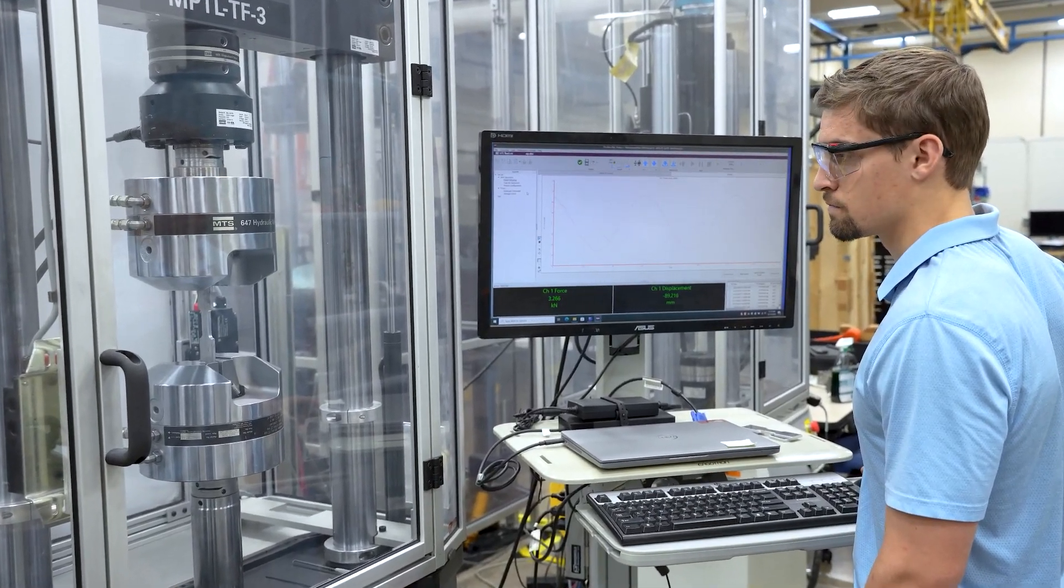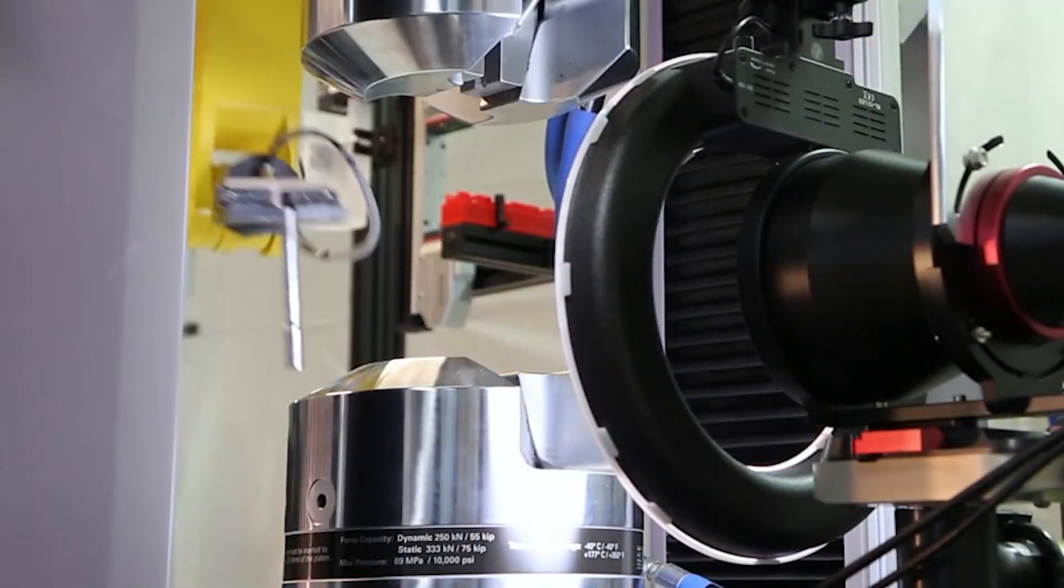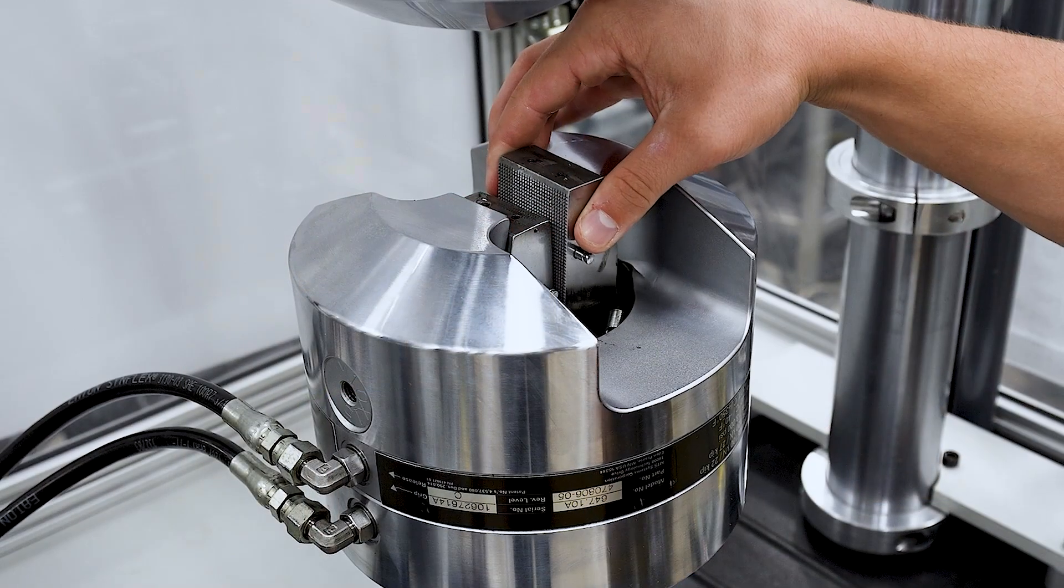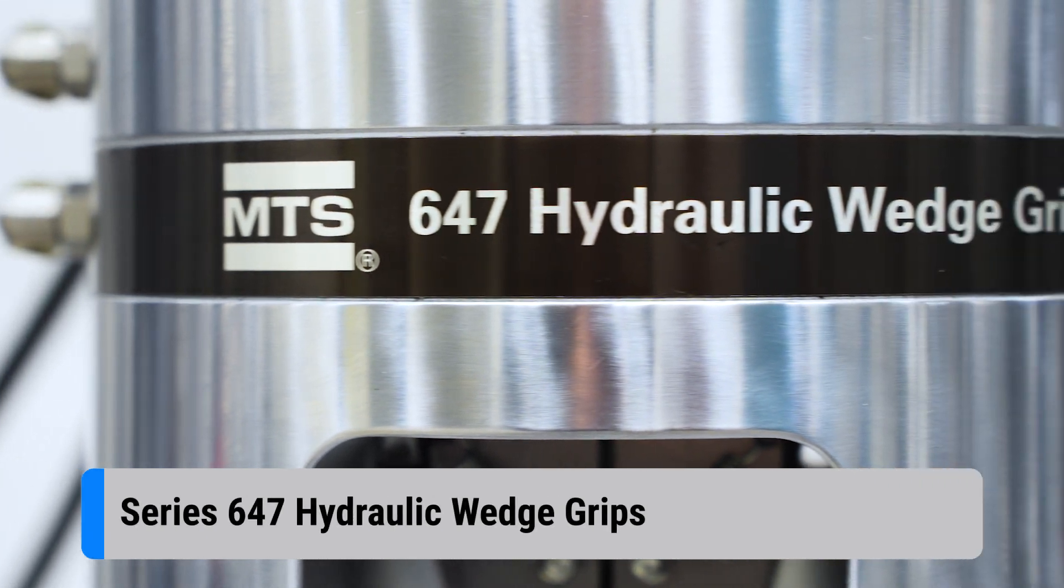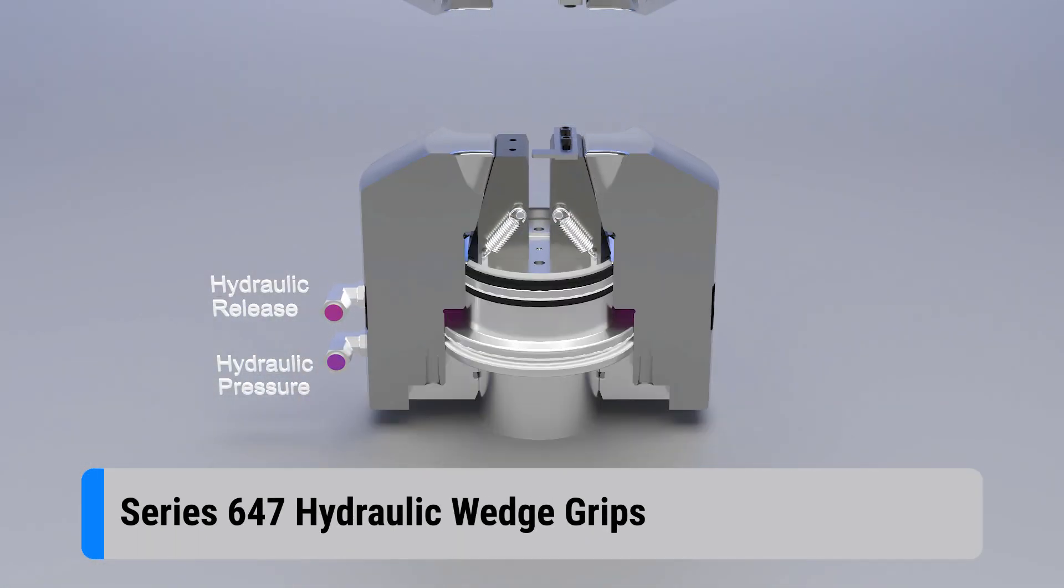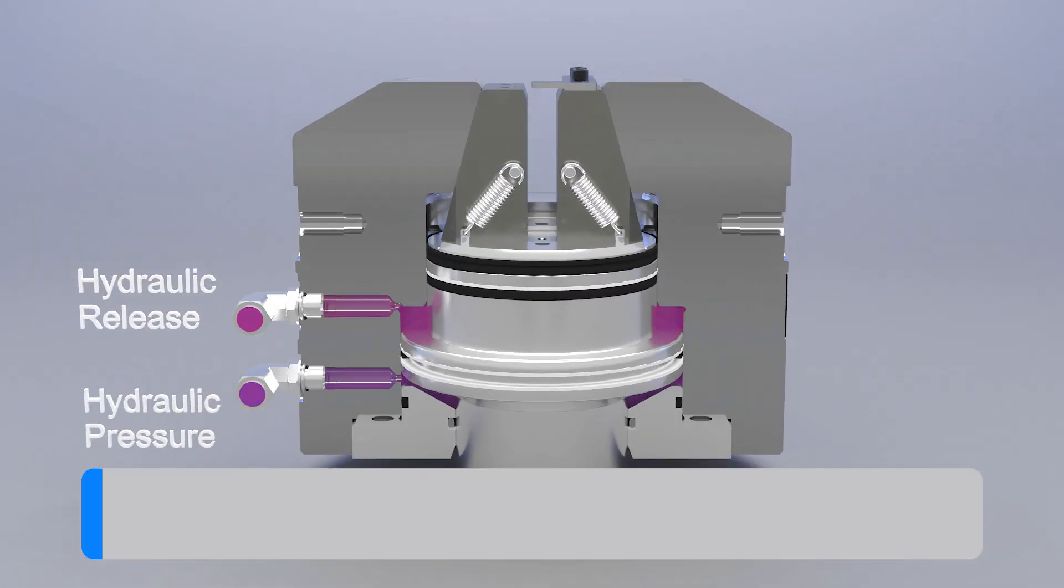Maintain confidence in your test data, even if you need to run many tests in a short period of time or change test setups quickly. MTS Series 647 hydraulic wedge grips are a great choice for fast repeatable testing.